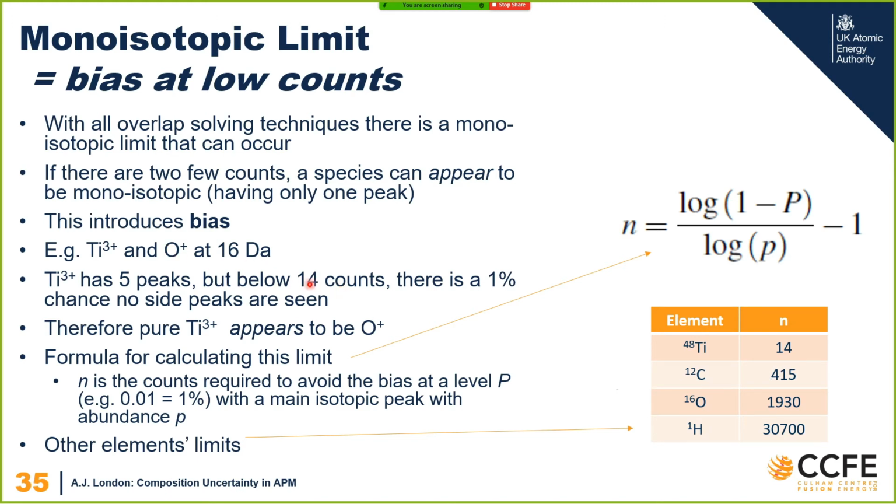And there's basically no way around this apart from having a better detector, like a kinetic sensitive detector. That doesn't help you if you have the same charge state ions that overlap like this, though.